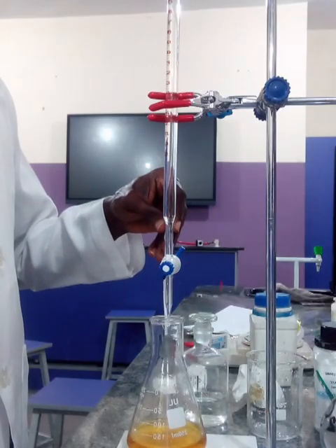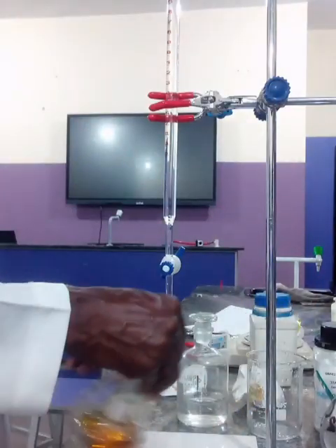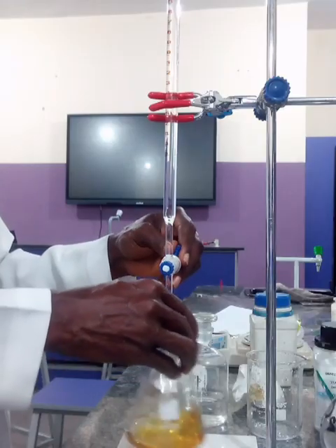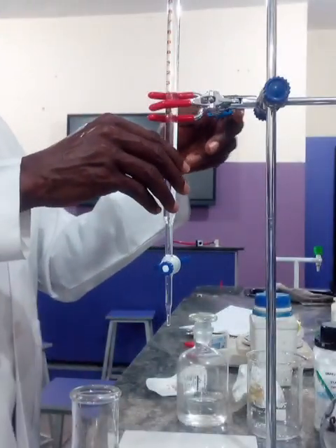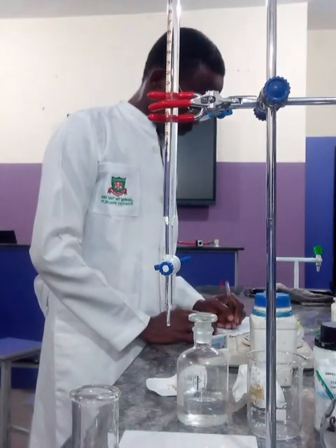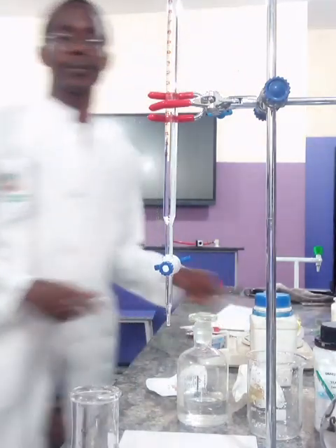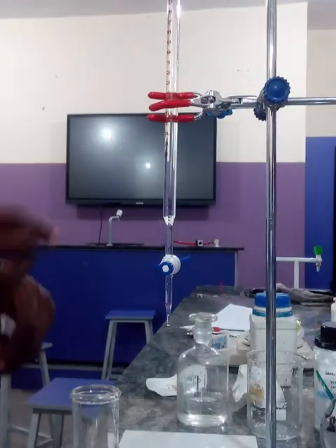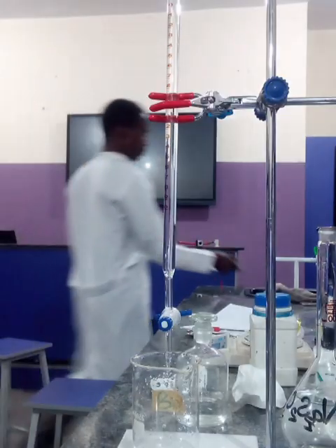Once you get that volume, you can use it to calculate the concentration of the diluted bleach, the one you prepared. Now after getting the concentration of the diluted bleach, we can use the dilution formula to determine the concentration of the actual commercial bleach.